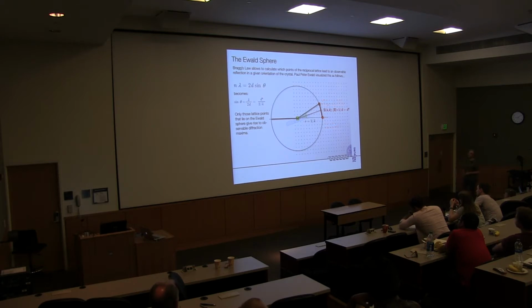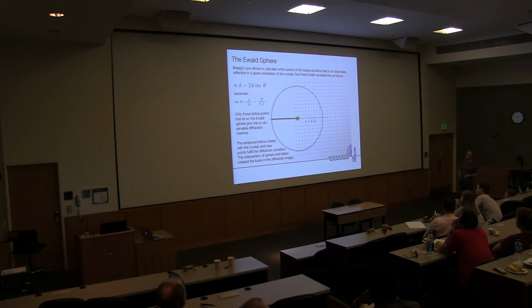And that means that if you have your reciprocal lattice, out of all the reflections in the reciprocal lattice, only those will be on the Ewald sphere. And those are the ones that you will see on a diffraction image. And that's why it has this funny shape. That's why you have these lunes and these round things on the diffraction image, because in principle you're looking at an intersection of a sphere with a linear reciprocal lattice. That's what you have. And of course, if you rotate this whole thing, if you rotate your crystal and you rotate the reciprocal lattice, which usually works a bit smoother, you get different reflections into reflection condition. You can try this again. Same thing, you always move the reciprocal lattice through here, and that's what you see happening on the detector from image to image.